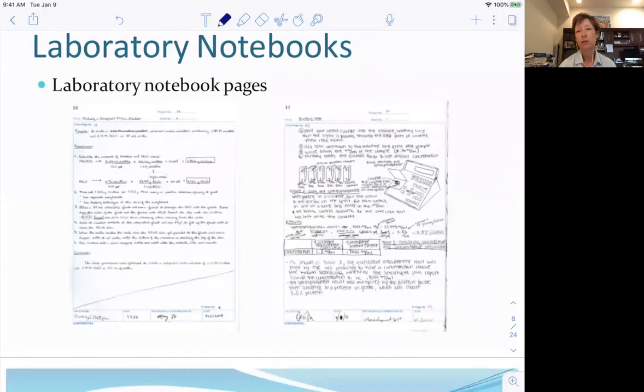We are using the digital lab notebook, but I encourage you to keep a bound notebook of things you do in lab, and that way you can simply scan or photocopy your lab notes to the lab archives. This shows you some examples. These are taken from your book, but you can see the elements of the lab entries here, with little diagrams or sketches and tables for data.